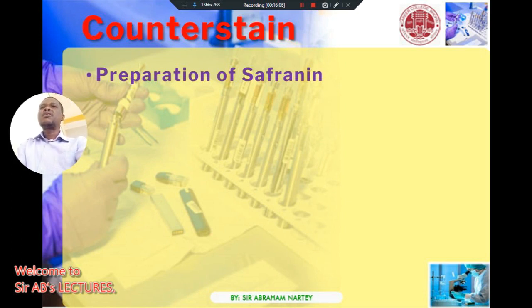After we have decolorized the primary stain, you apply safranin, so that if the specimen is gram negative, or any part of the specimen did not absorb the primary color, the safranin, or the counter stain, is going to take up color so that it will bring contrast. That is the more reason why.